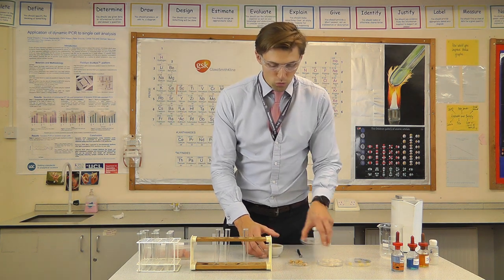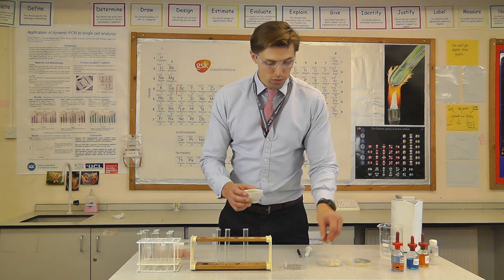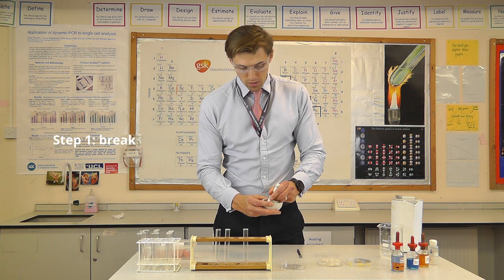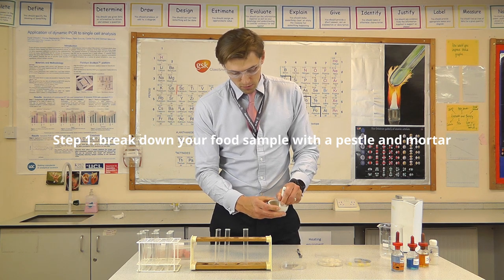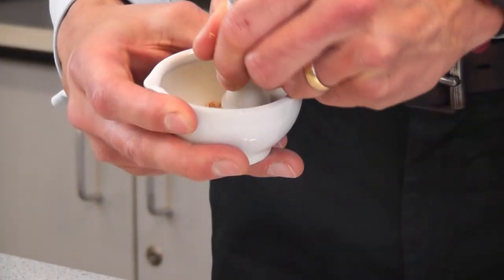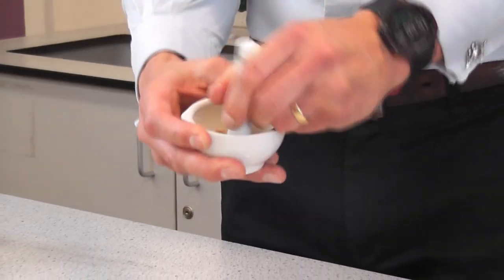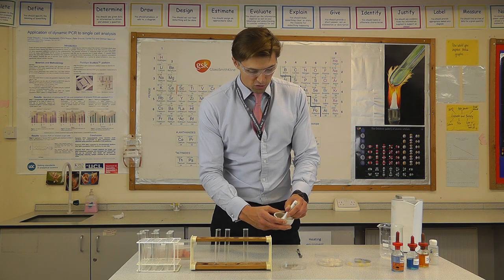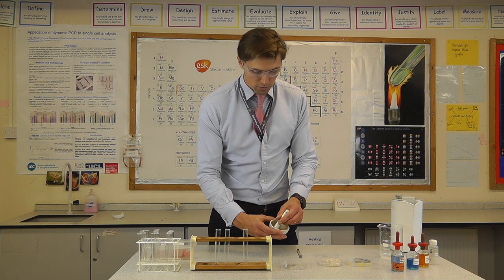So I'm going to pour my biscuit into the pestle and mortar and crush it up. I'm not bashing it with my pestle — I'm just applying gentle pressure to gradually break down the biscuit. I want to get it to a fine crumb.